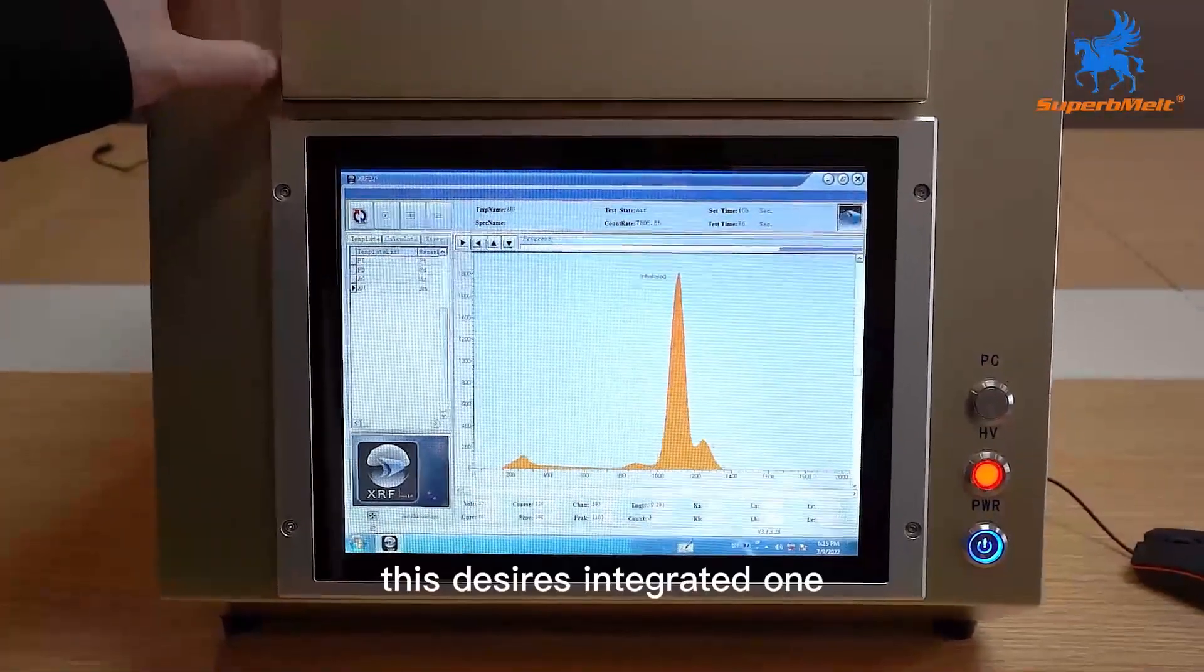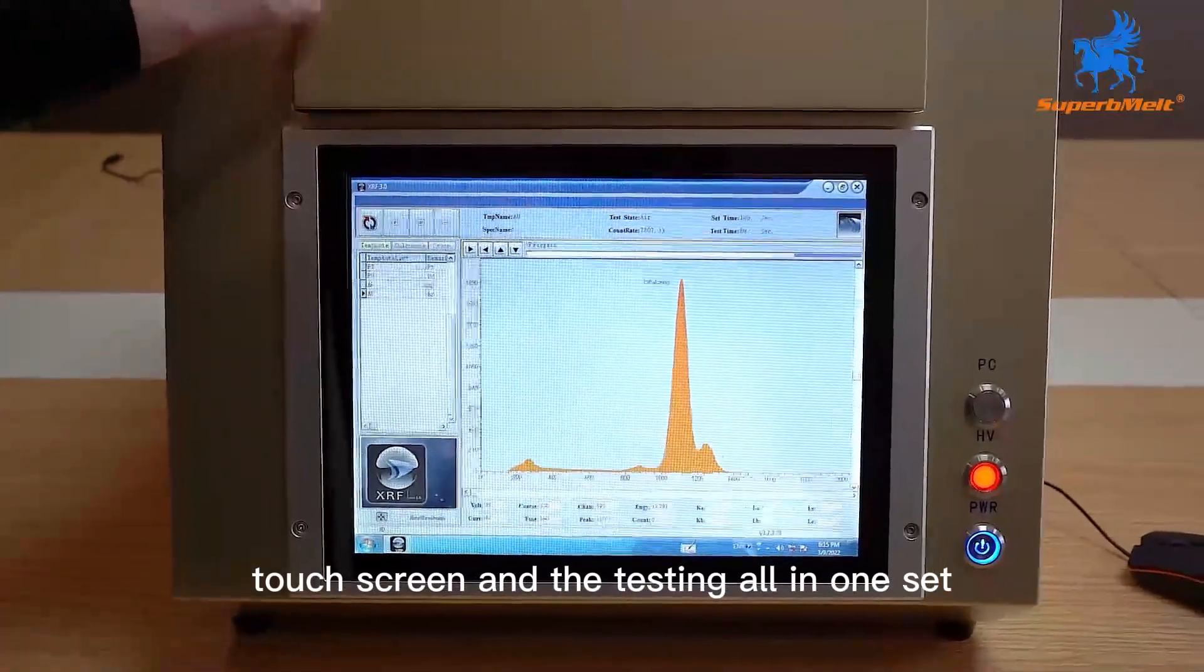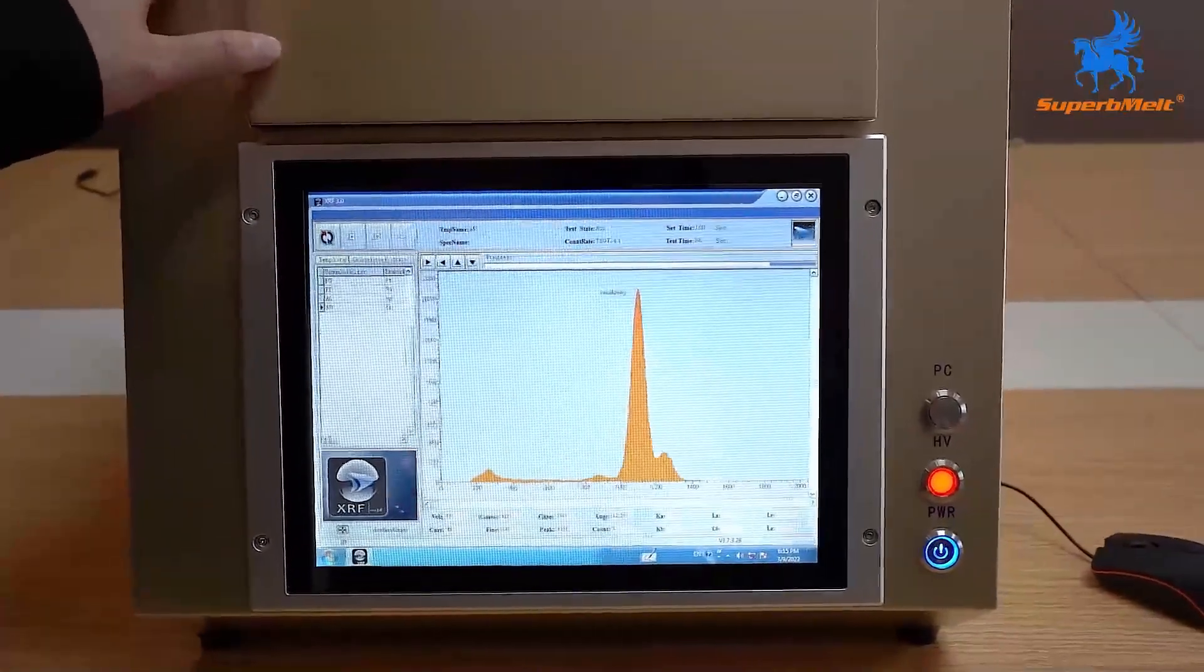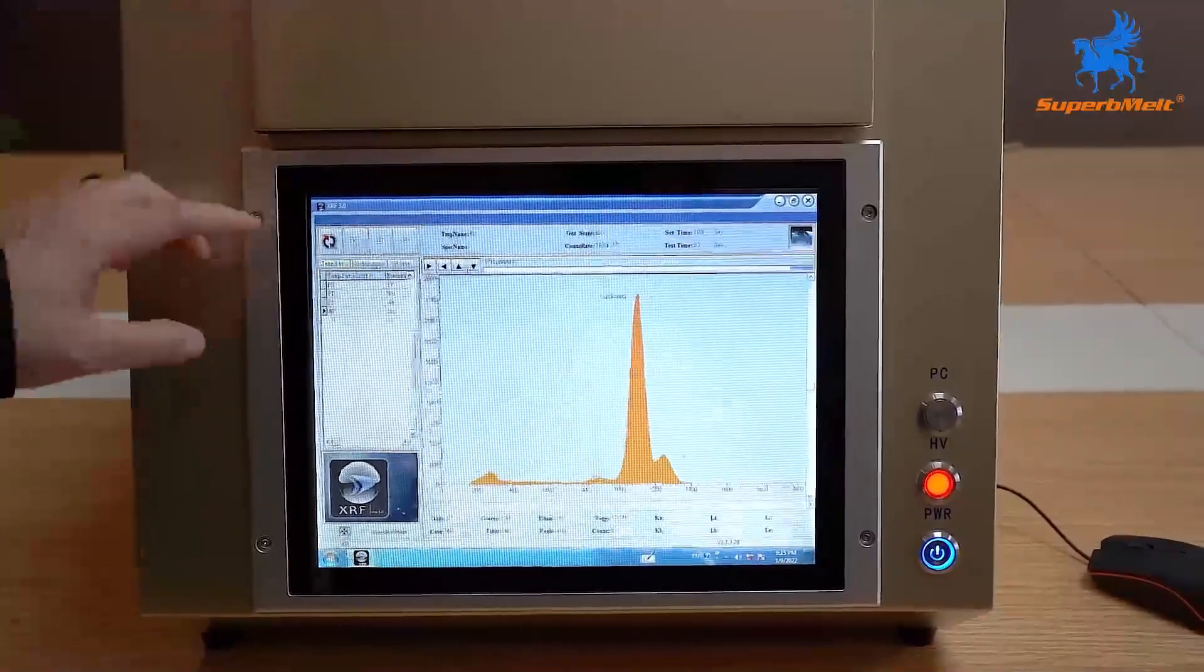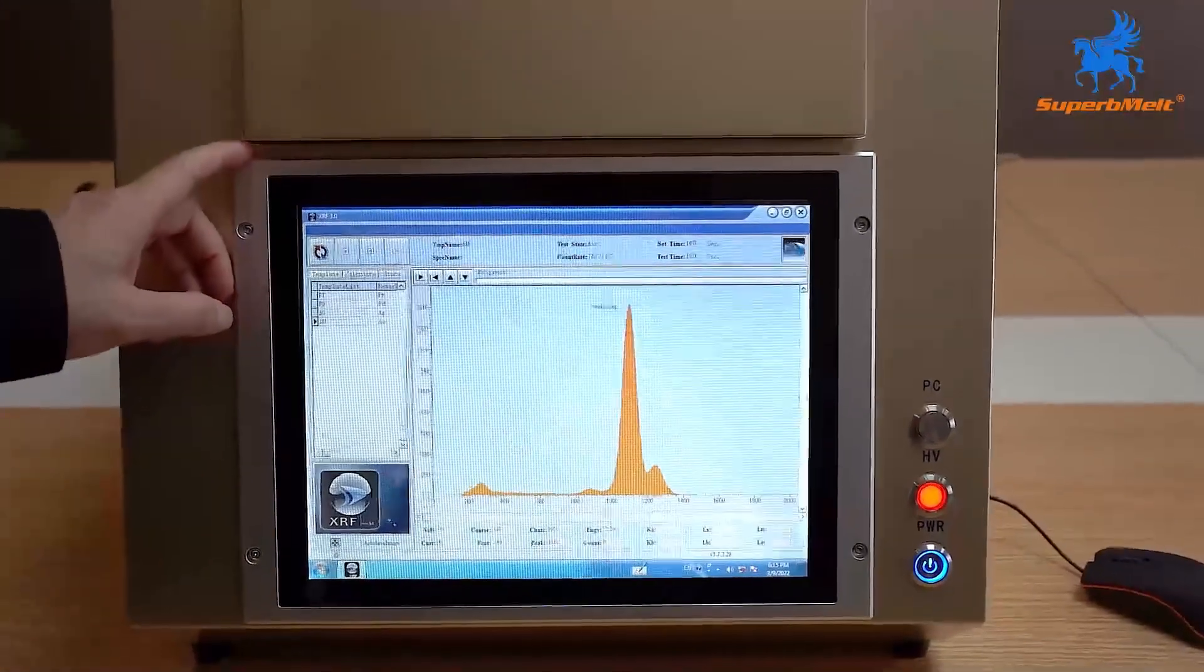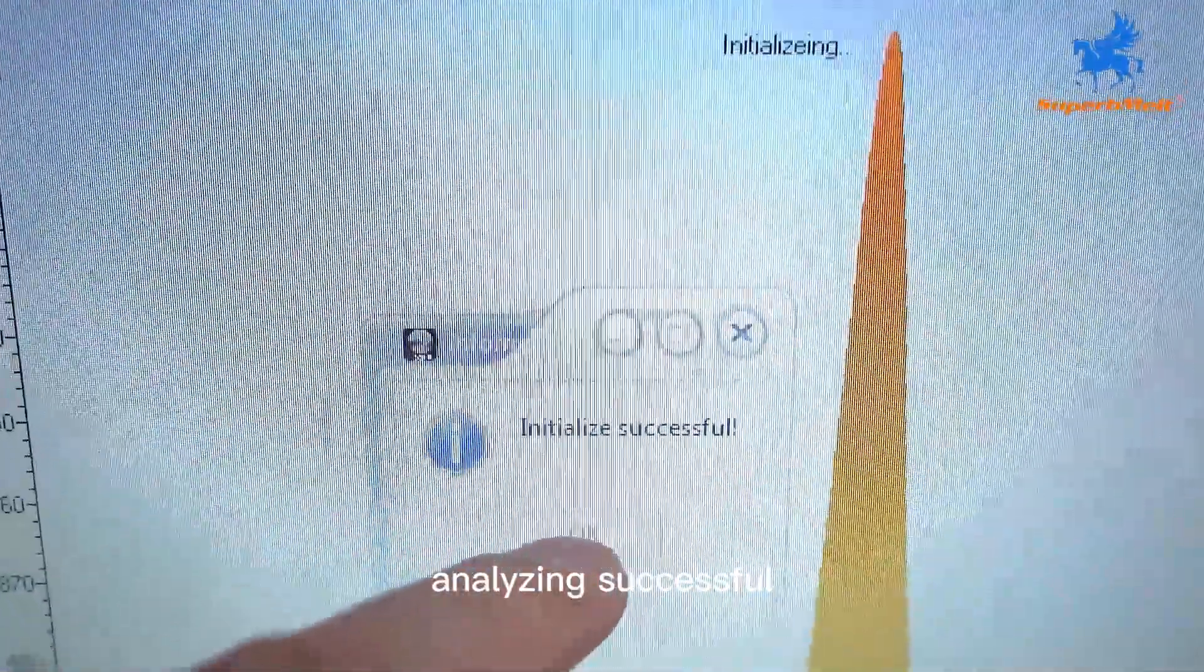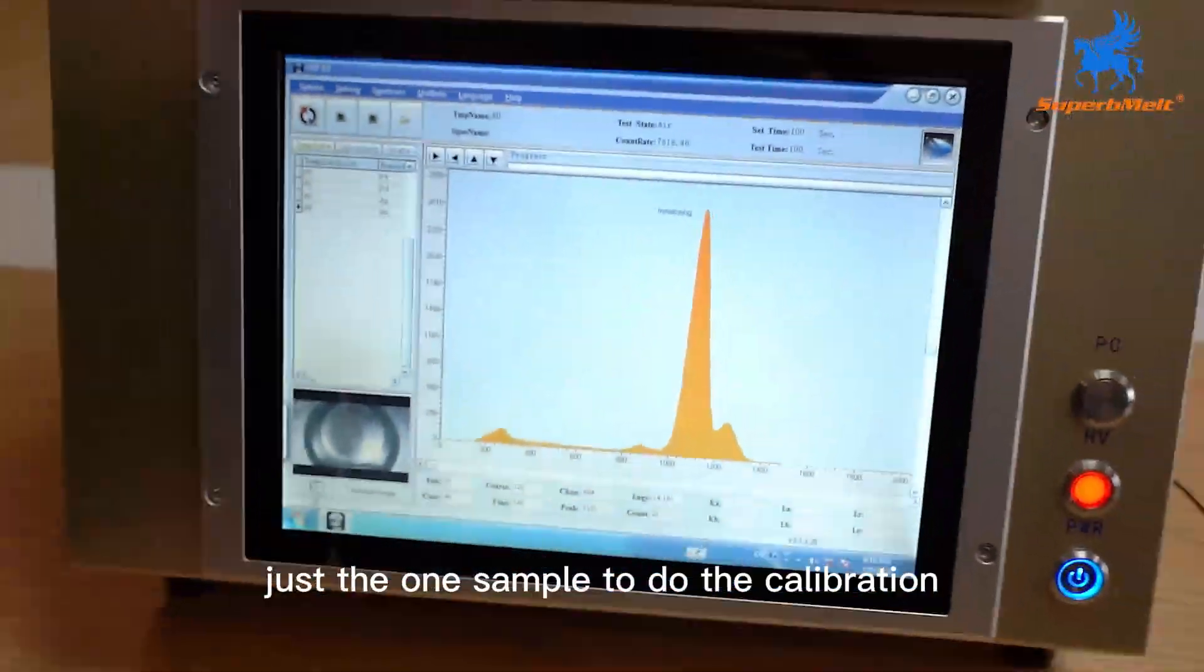This design is integrated one, touch screen and testing all in one set. Analyzing successful. Just one sample to do the calibration.